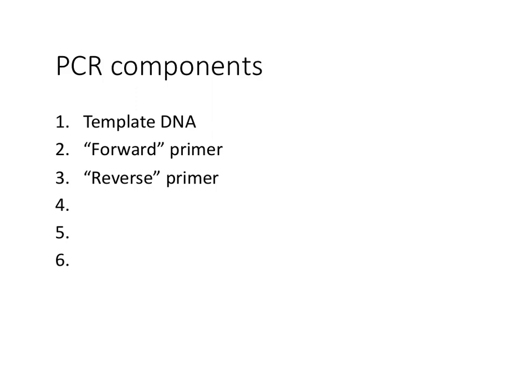So if you're going to set up a PCR reaction, last bit about PCR, then we're going to talk a little bit more about analysis. We need these 3 parts that are DNA: the template, double helix, a forward primer and a reverse primer, trillions of each.